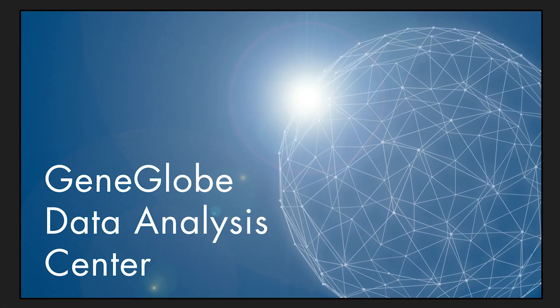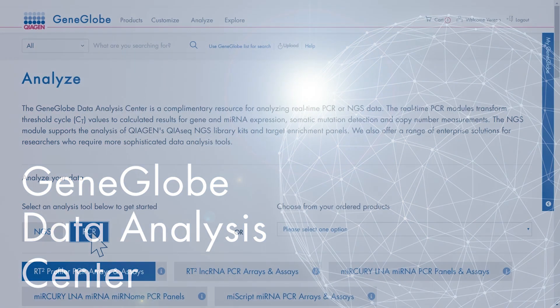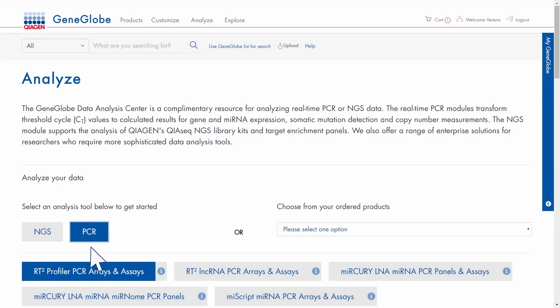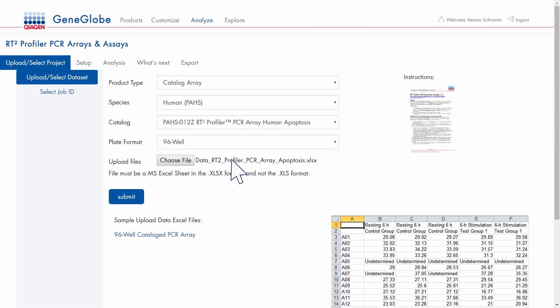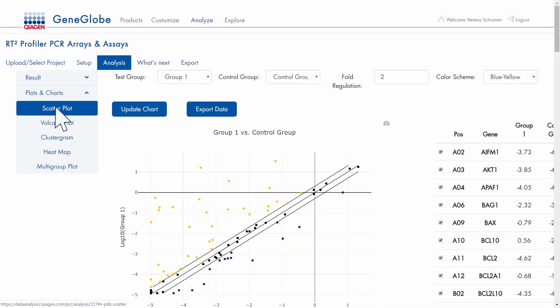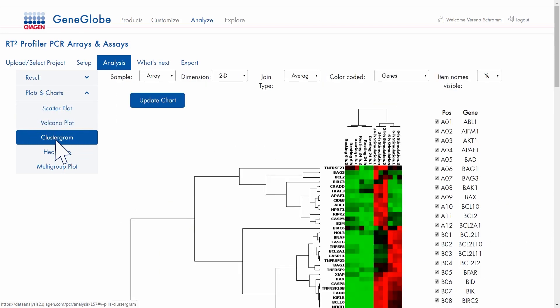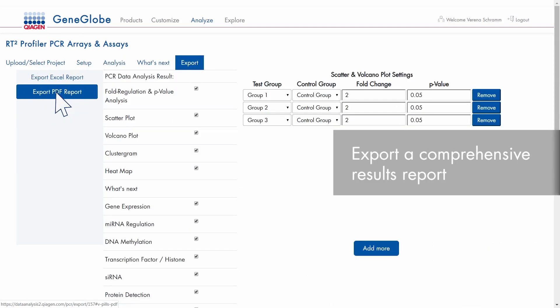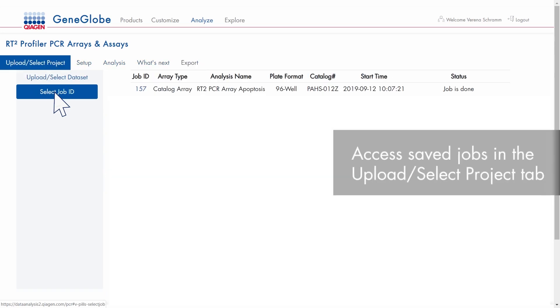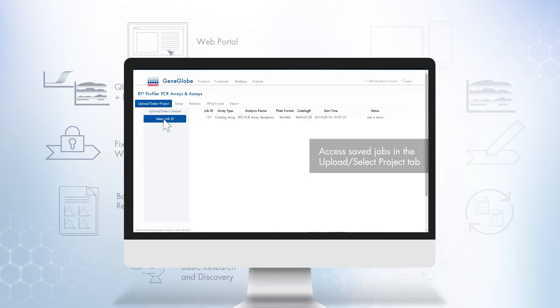No special bioinformatics expertise is required. Just upload your data to the respective analysis tool and provide the details of your experiment. Review the plots and charts for quick insights and download the analysis results. The results are saved in the analysis tool or in MyGeneGlobe and can be accessed or re-analyzed again.